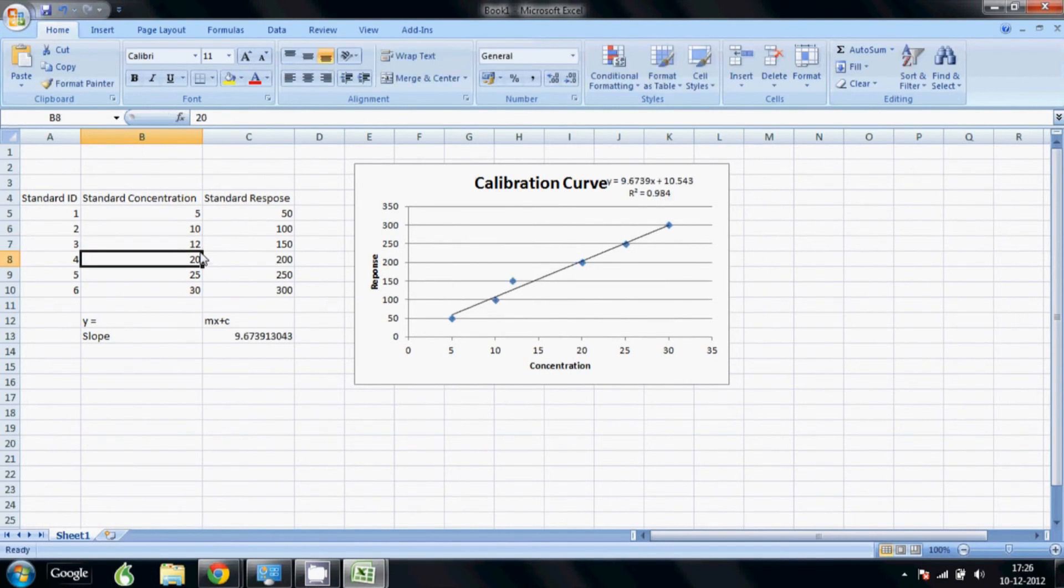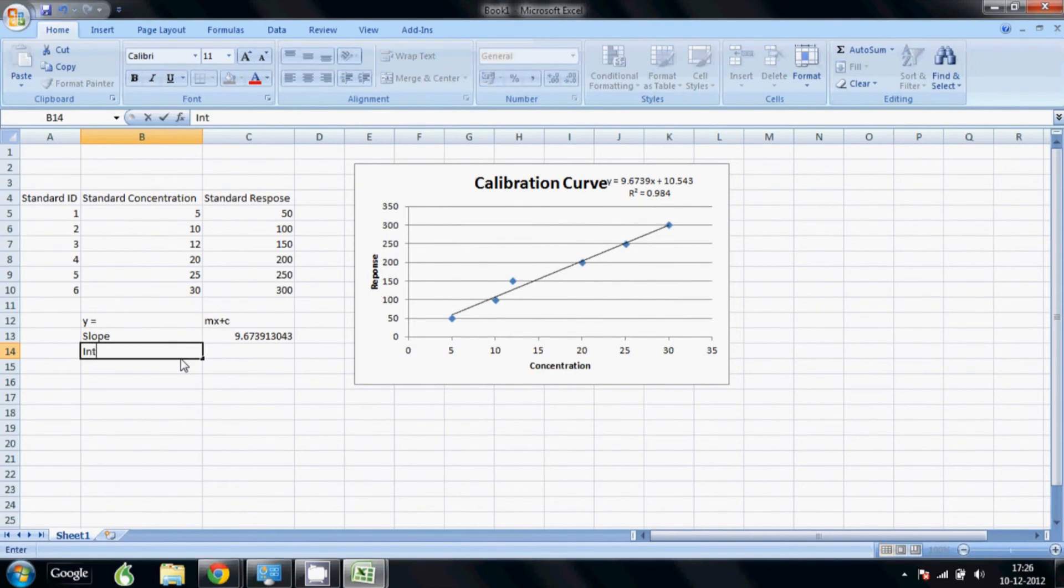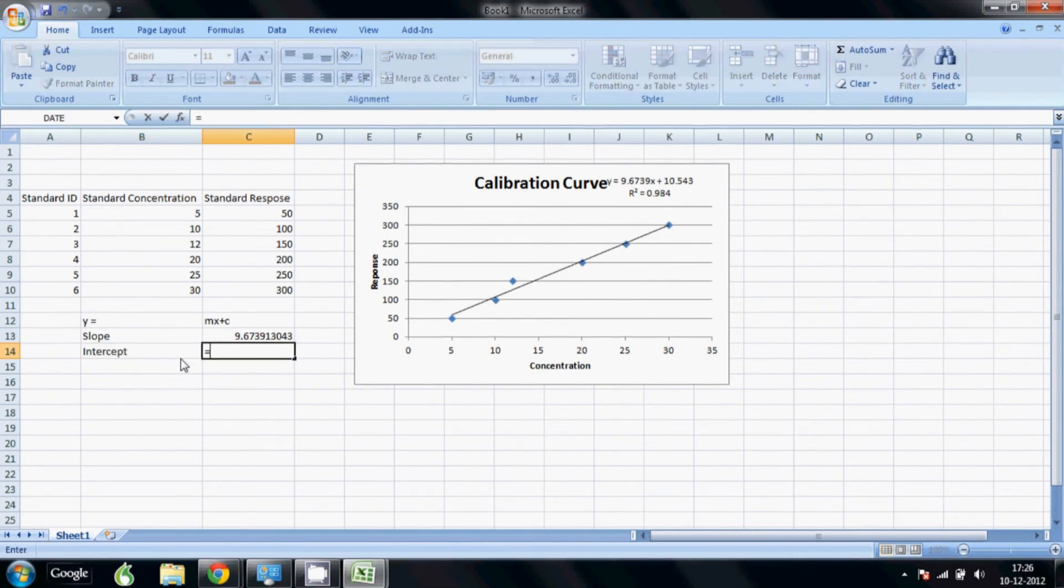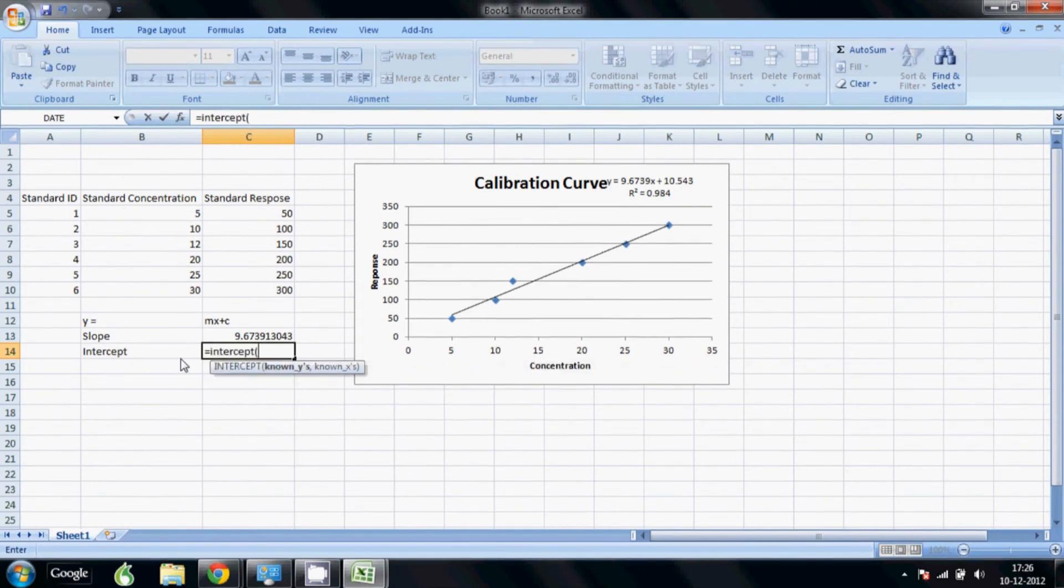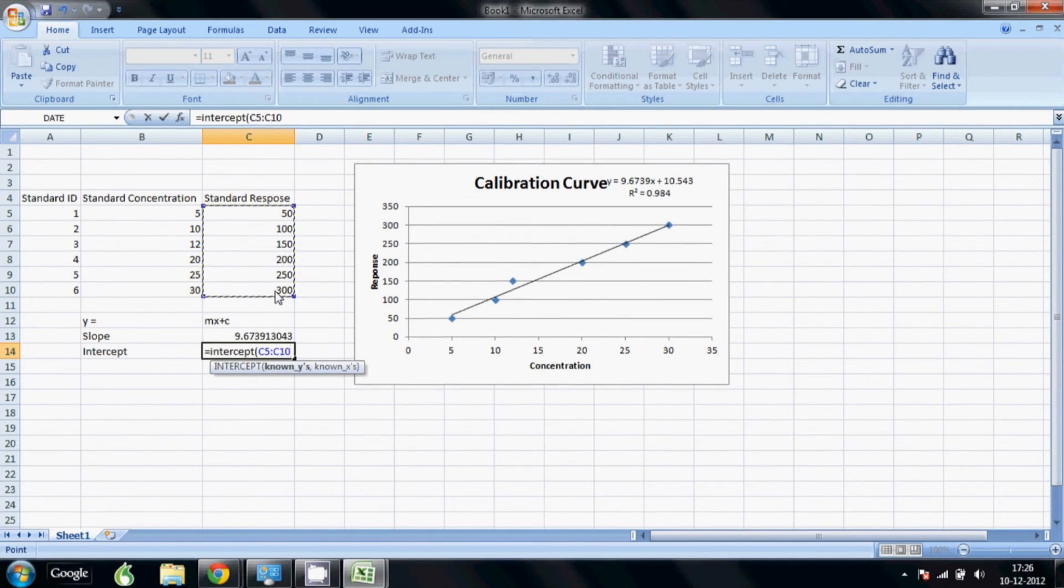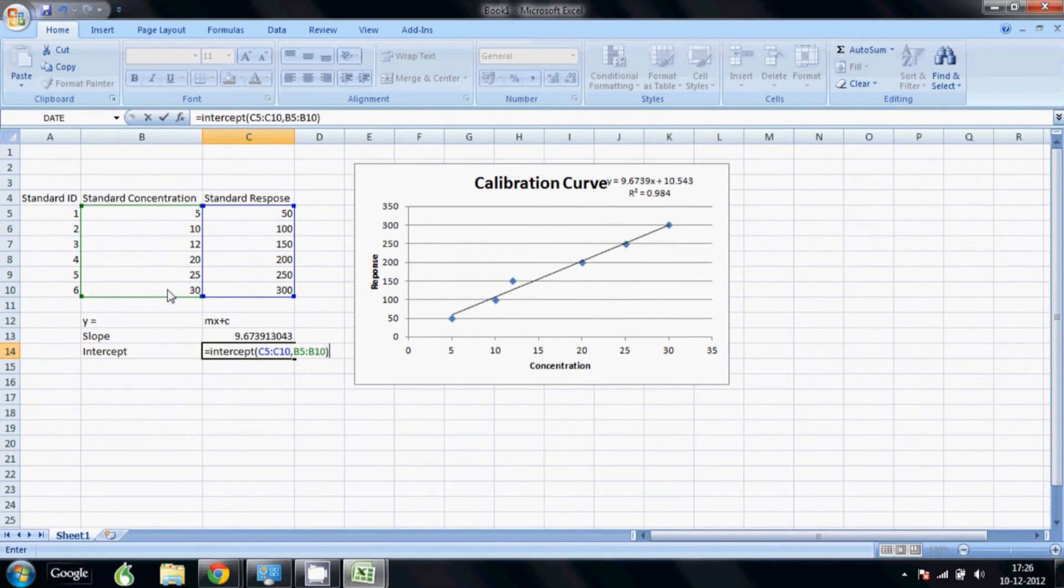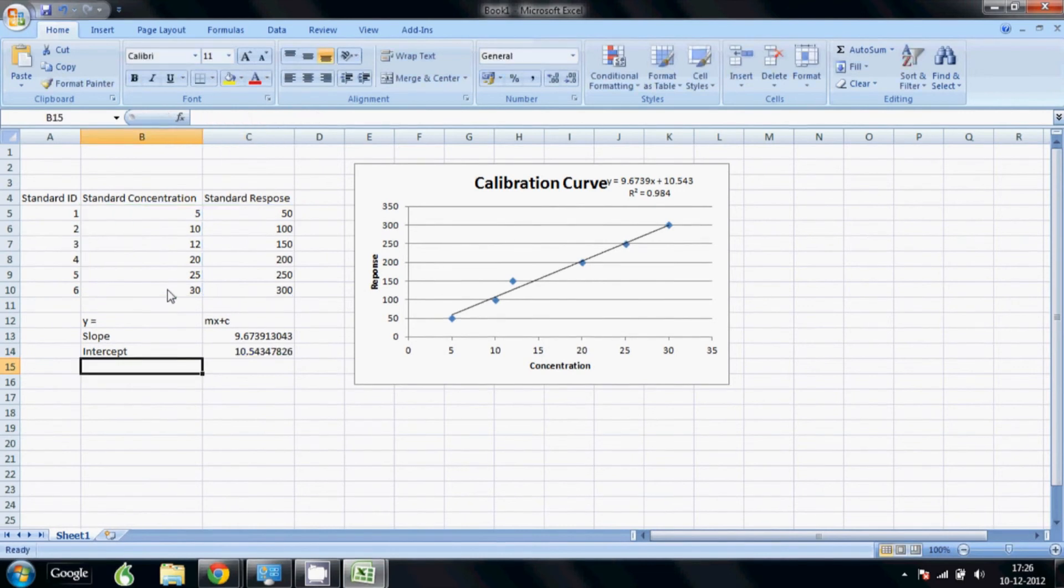Just to get the intercept also I change this value, so now you have an intercept. So now I will put the intercept formula. Again select the known y's and known x's, close the bracket, and you see the values here and here are exactly the same. Now using these values we can calculate the result for any response that we get.